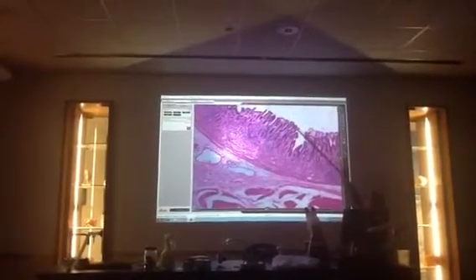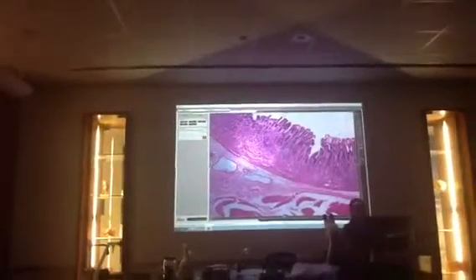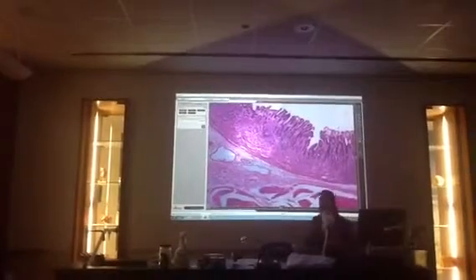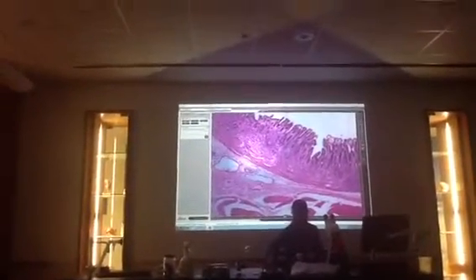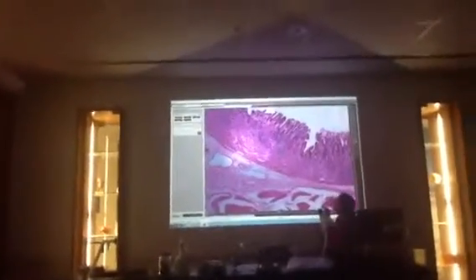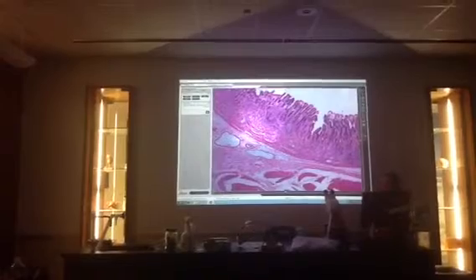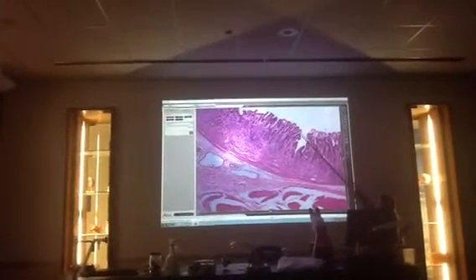Gastric pit. Very good. The type of cells that make up the epithelial layer are not going to change between the three types of the digestive tract here. So it's all simple columnar. I'm going to have to go up another magnification to show that, so I'm going to wait on that. But the simple columnar is what's lining the gastric pit.